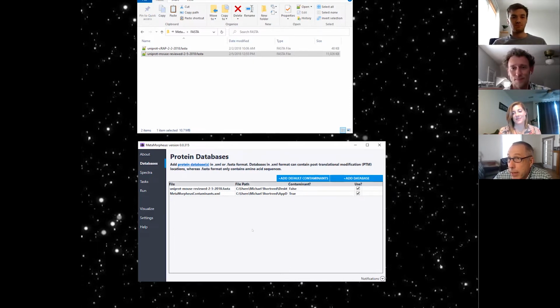To be honest, ours started with the CRAP. We also borrowed heavily from MaxQuant's Andromeda search engine. They provide a contaminants database, and we looked at theirs too, and combined some of that. So, full disclosure, we're standing on the shoulders of giants here. This isn't a product of our own work. It's an incremental improvement on some excellent scholarship from other people before us.